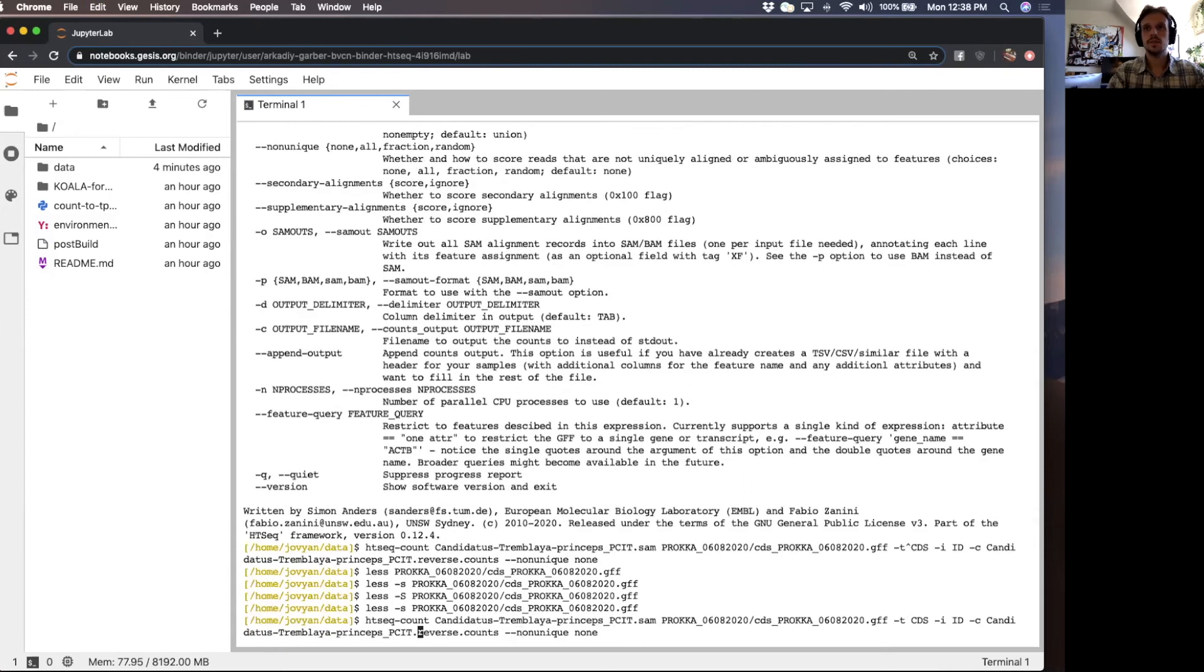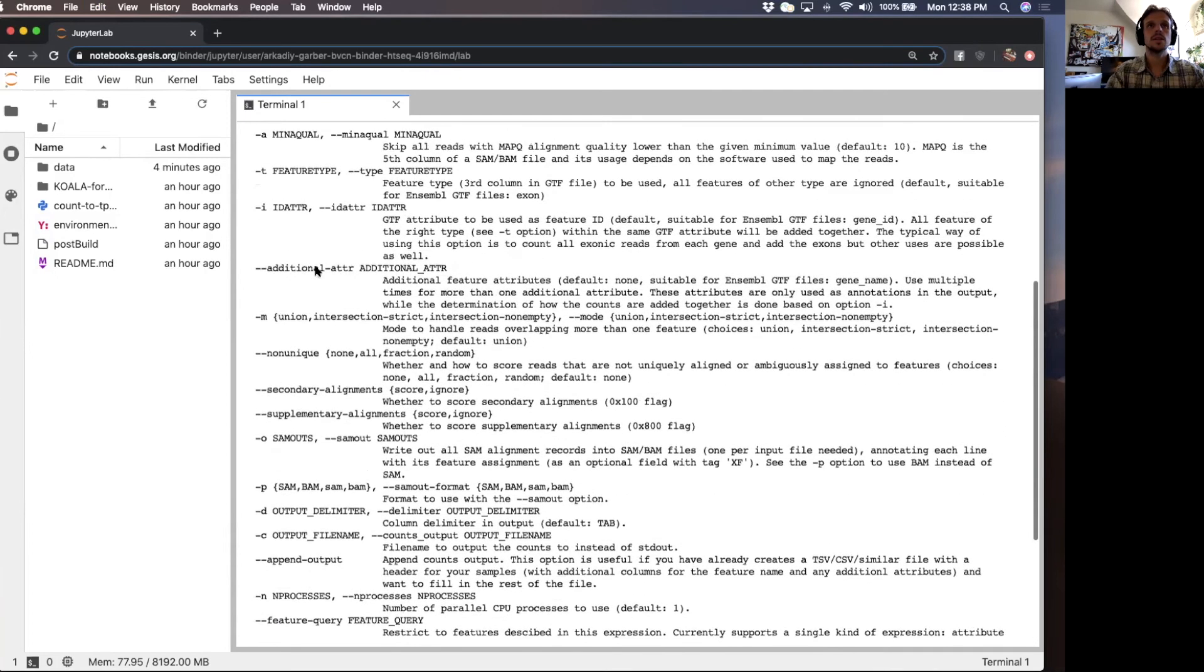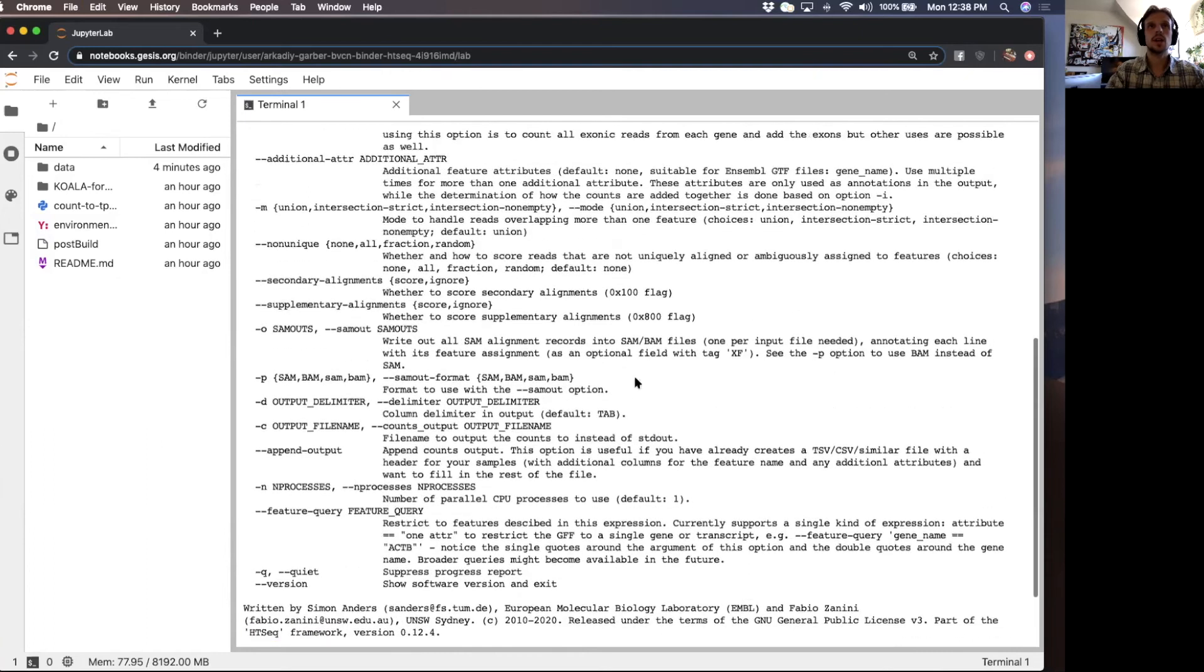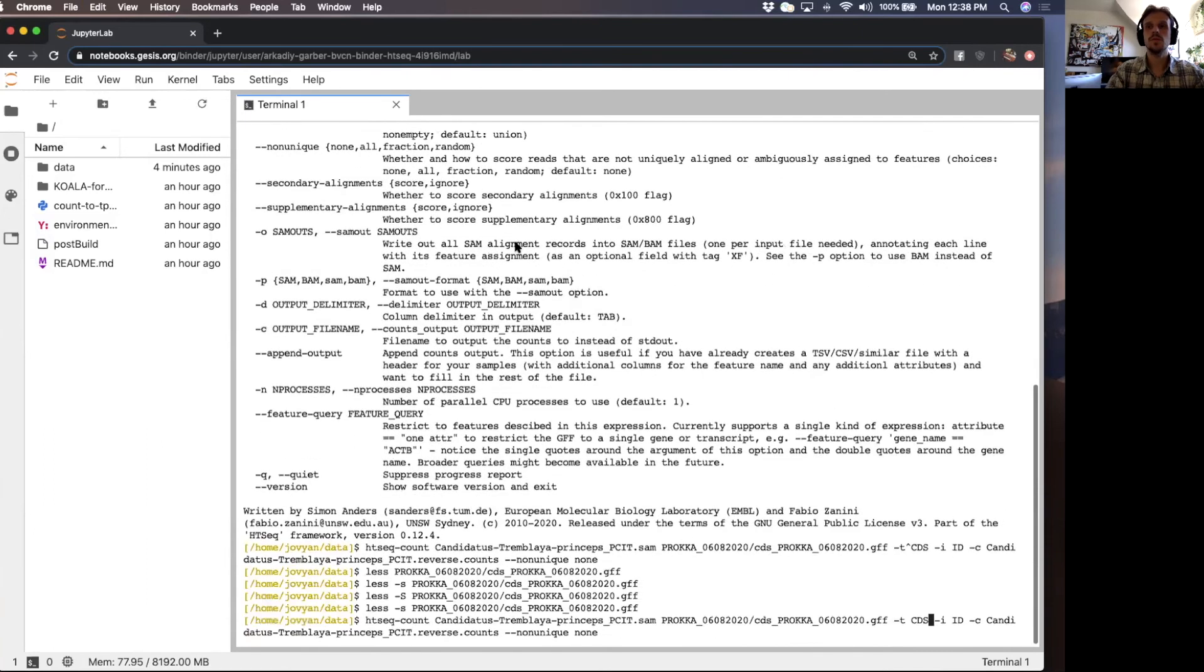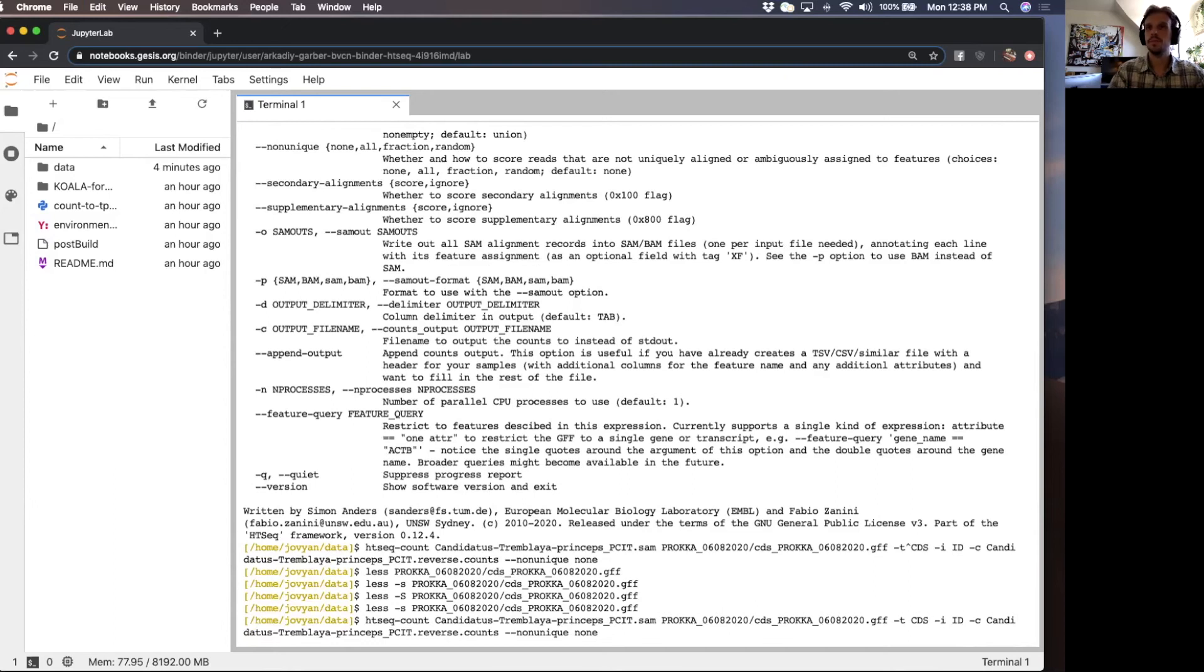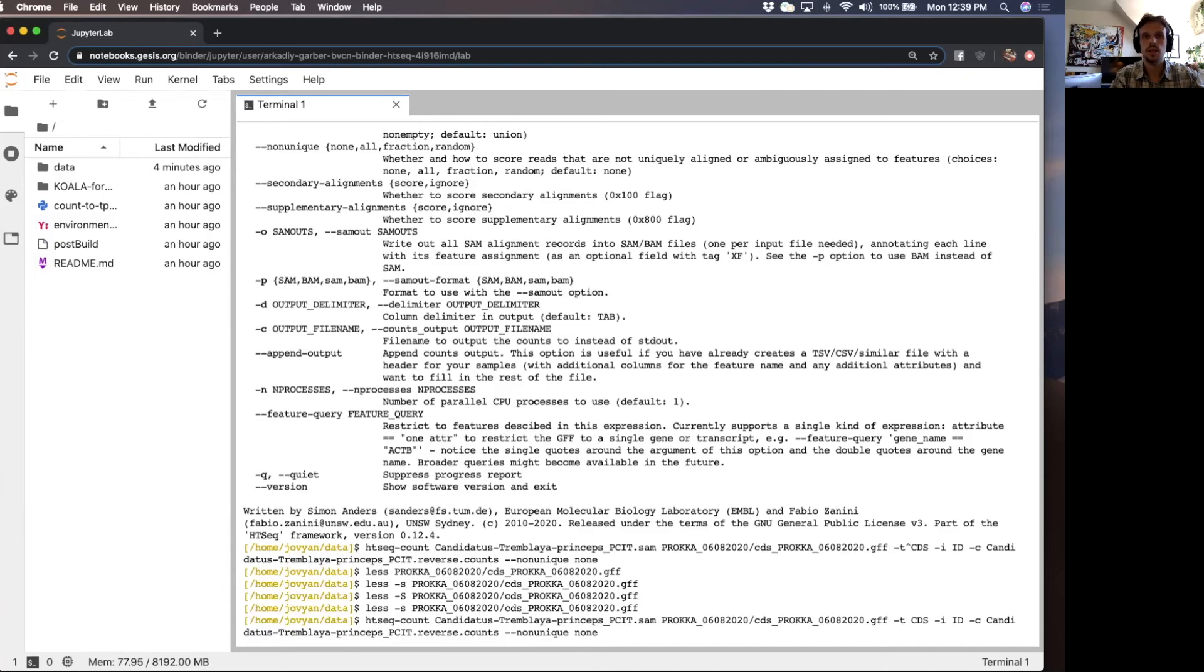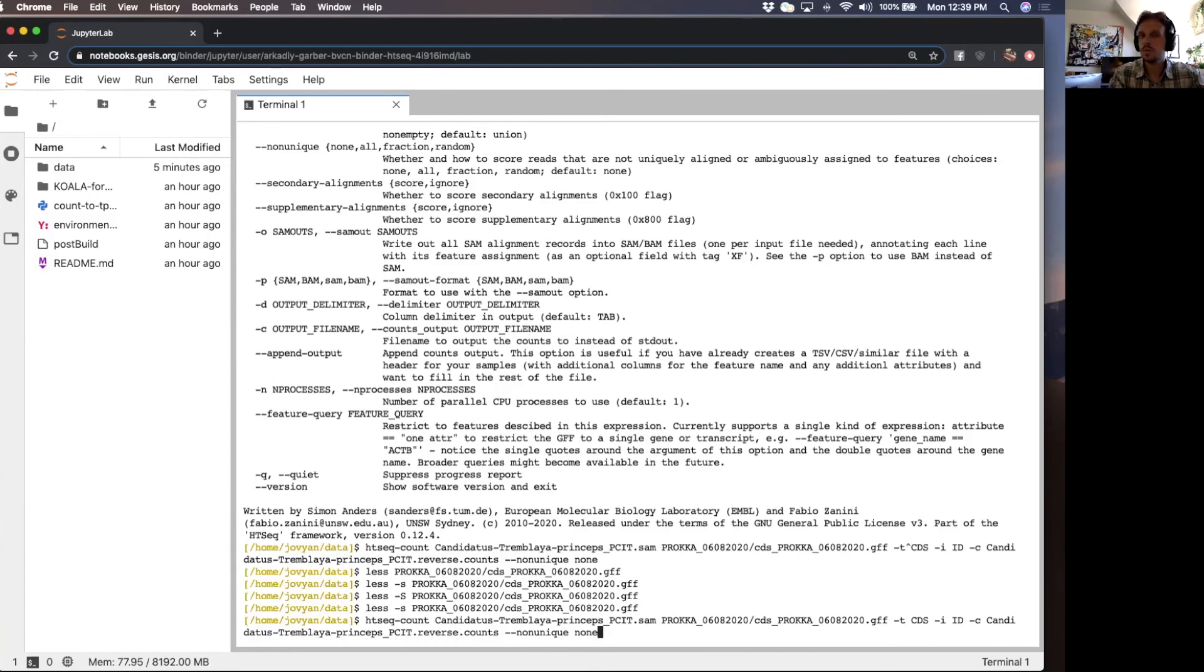In this command, I specified that the dash T, the feature type will be CDS because I'm interested in coding regions here. And dash I, the attribute is going to be ID because I want the locus tags to be the first column of the outputted counts table. And then dash C is the output. As I mentioned in the lesson, I typically exclude ambiguously mapping reads. So I put dash dash non unique none. If a read is non unique, that means a read doesn't have only one gene feature that it maps to, but has more than one gene feature that it maps to, I want that excluded.